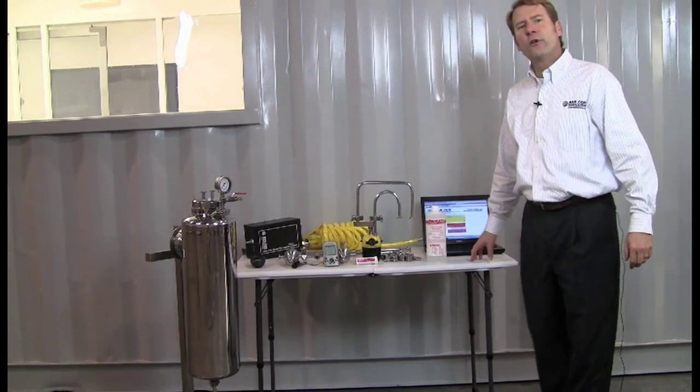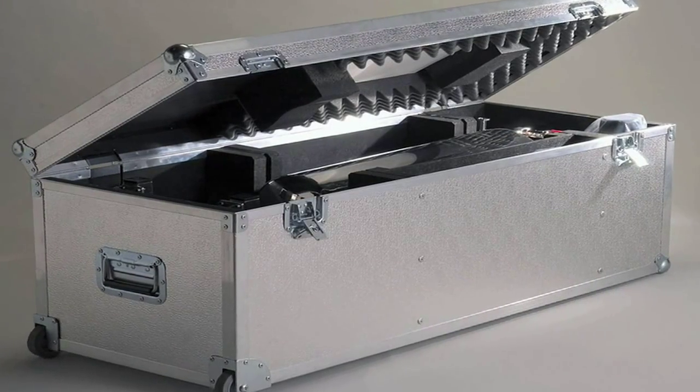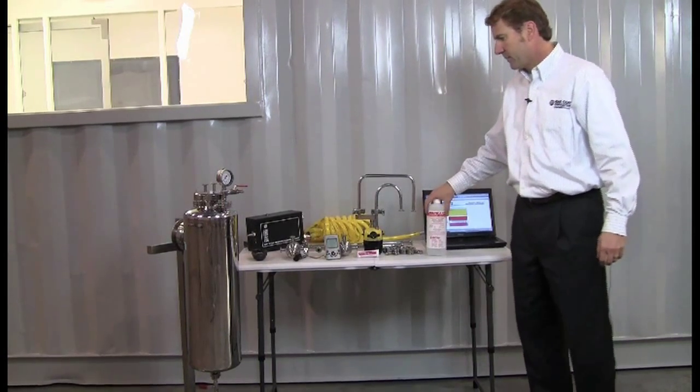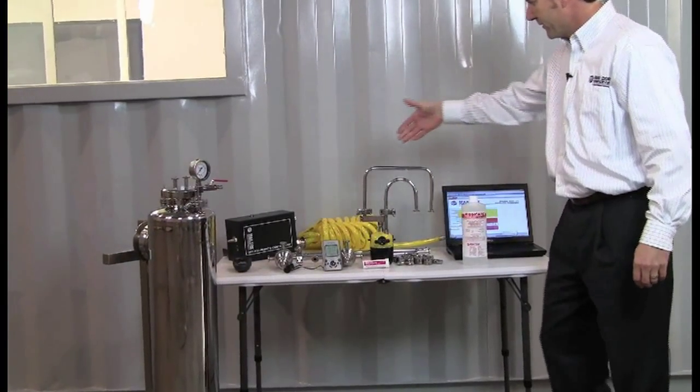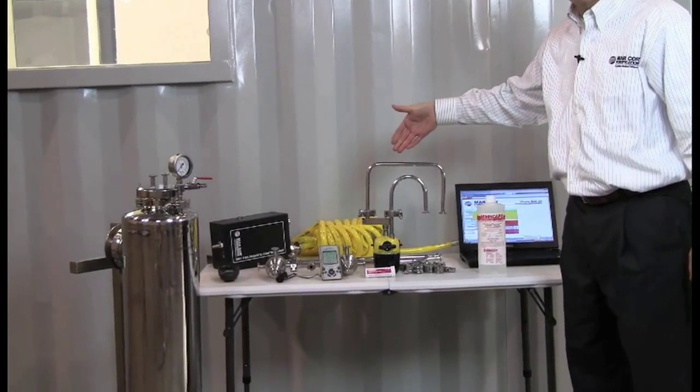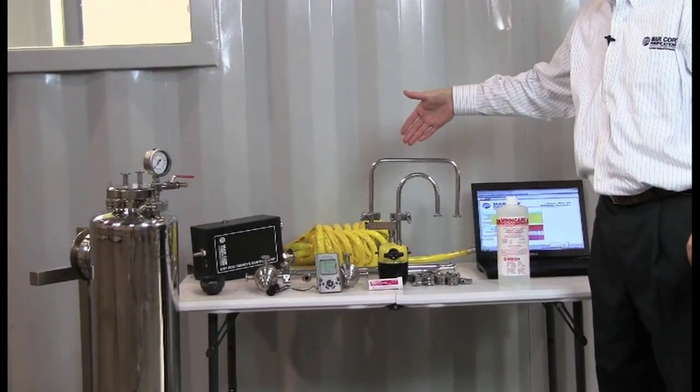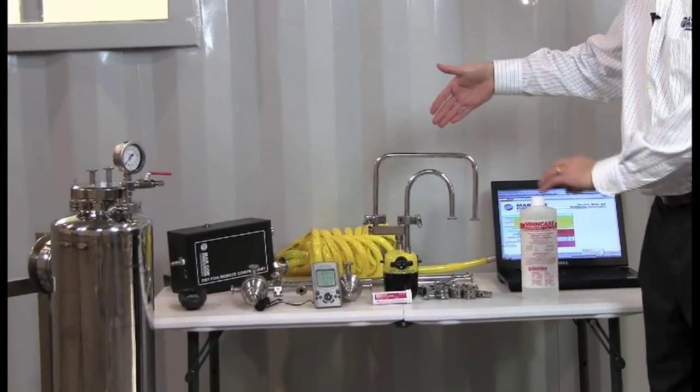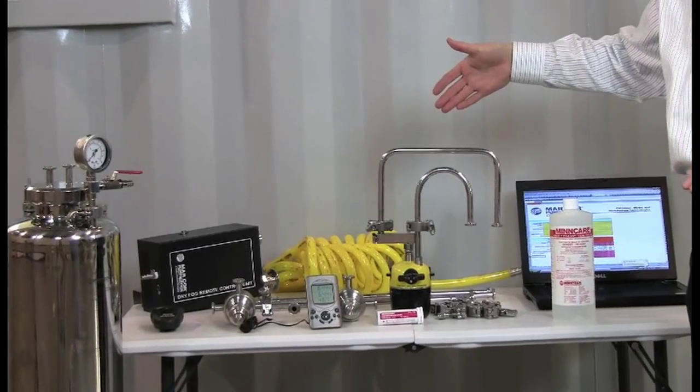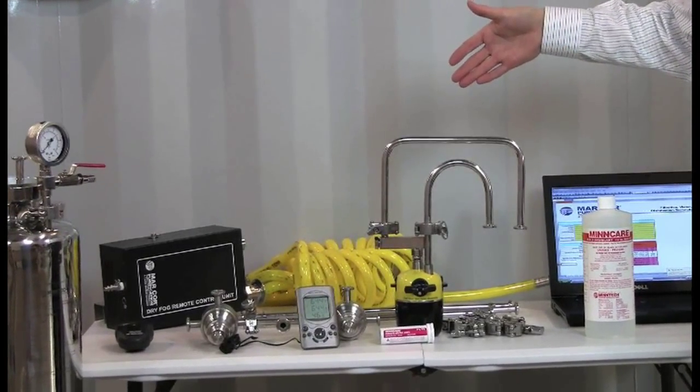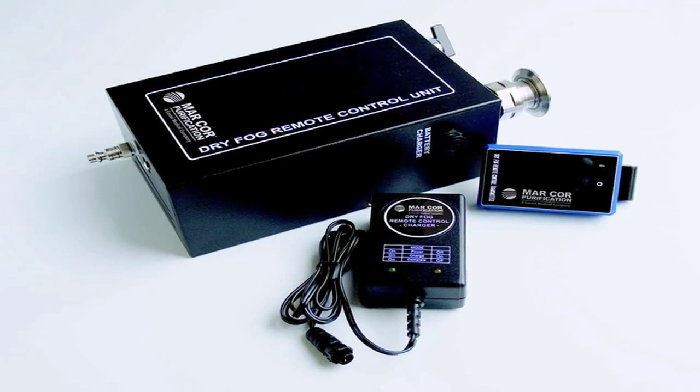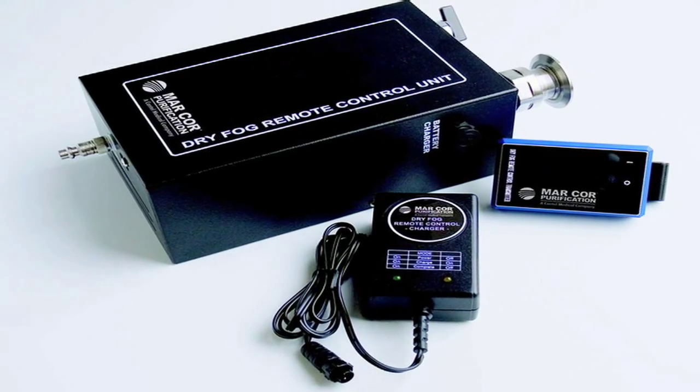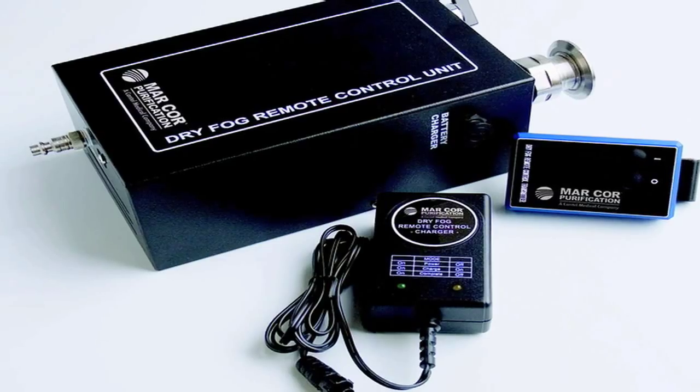These are the components to the Markor dry fog system. The Markor dry fog system utilizes MinCare that goes in the tank. This is the head, which is actually the heart of the unit that puts out the 7.5 micron droplet and gives you the ability to disinfect 35,000 cubic feet of clean room at one time.